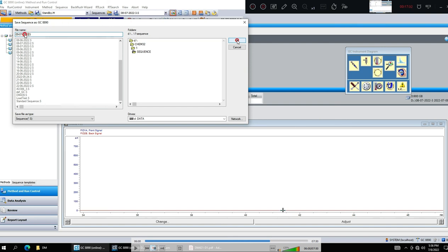It would be better to do it 2022 minus 07 minus 09. So in the other way, we will change that in the future, because otherwise it's not in a right order. So it will arrange it concerning the days and not concerning the year or month. So I will have to change that. So keep that in mind. It's first the year, then the month, then the day, not the other way around.